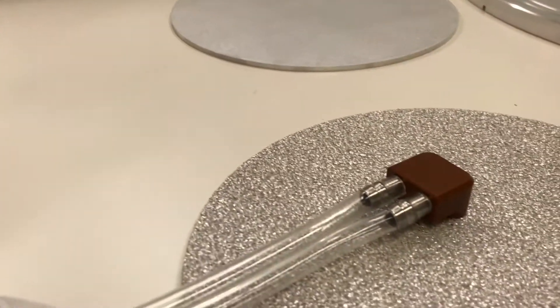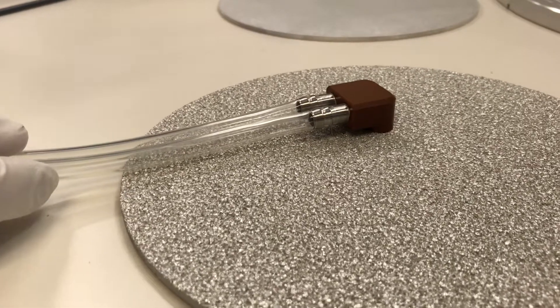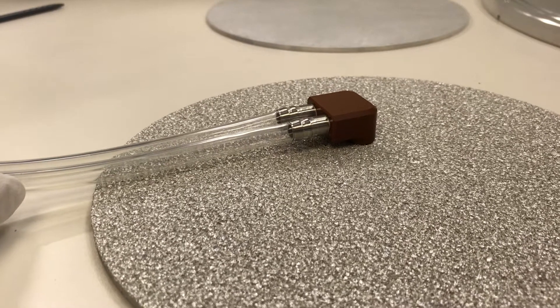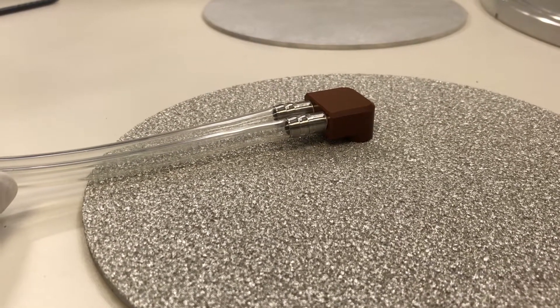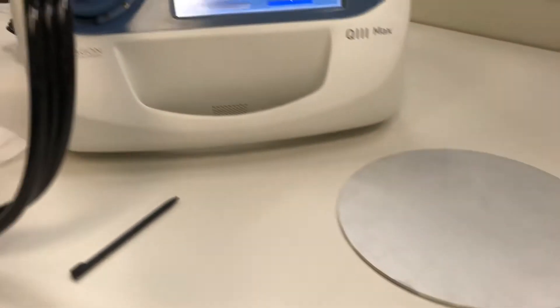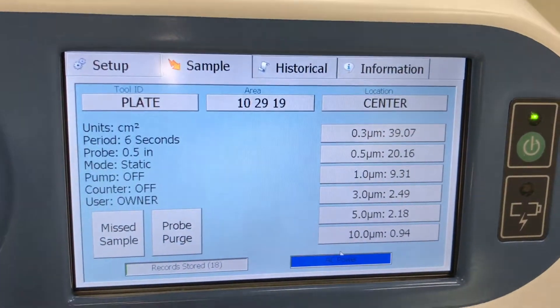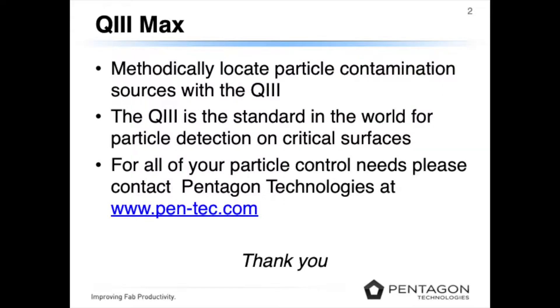Let's try one more measurement on the surface in a new location. In the new location, after the six second test, you'll notice that it also has a reduced particle count, down to 39.07 greater than 0.3 micron particles per centimeter squared. You can methodically locate particle contamination sources with the Q3.